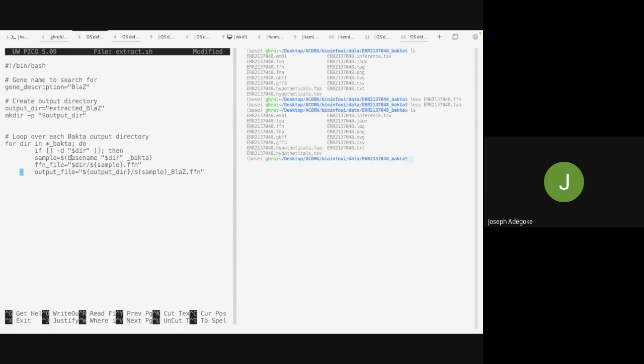And then the base name we've done as variable 2, and you will put it as dot ffn, because we've extracted the base name from the sample directory that we are in. So we now make it .ffn, so it knows where it is going.